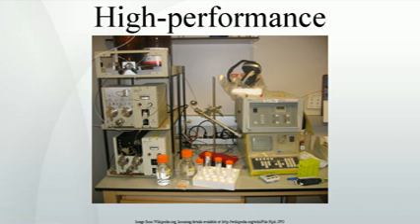Together the factors are variables in a resolution equation, which describes how well two components' peaks separated or overlapped each other. These parameters are mostly only used for describing HPLC reversed phase and HPLC normal phase separations, since those separations tend to be more subtle than other HPLC modes, for example ion exchange and size exclusion.